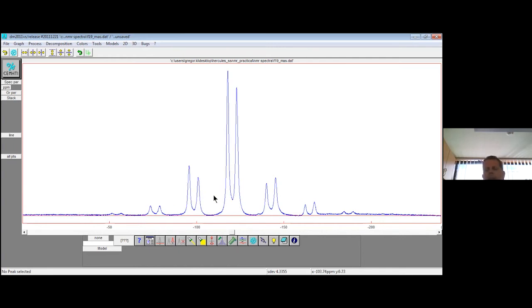And in this case, we will try to not only fit the spectrum and all these lines, but we will also try to use this information that is contained in the intensities of the spinning sidebands and the positions of the spinning sidebands to extract back the parameters which I've mentioned in the first part in the introduction, where I was talking about the contribution of chemical shielding to the transition frequency.